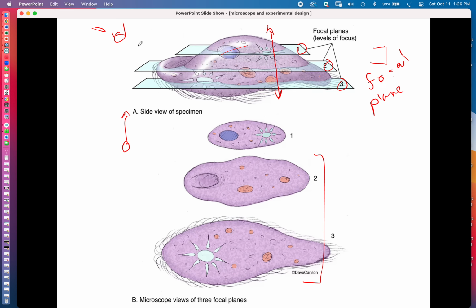And a confocal can collect data. A confocal microscope is a light microscope with additional features on it. One of them is that the focus is motorized. Another is that a computer is running the microscope, and we can control it through the computer. We can also program it and say, just take a series of pictures of the specimen, focusing down through it, and we'll get three or more really nice pictures.